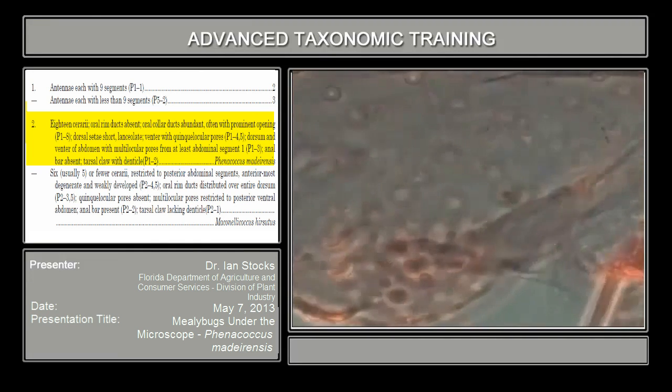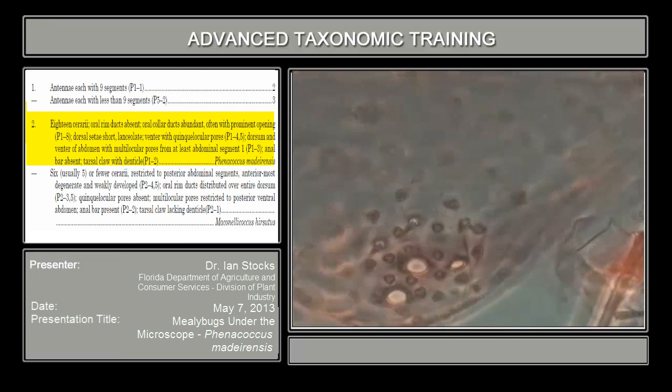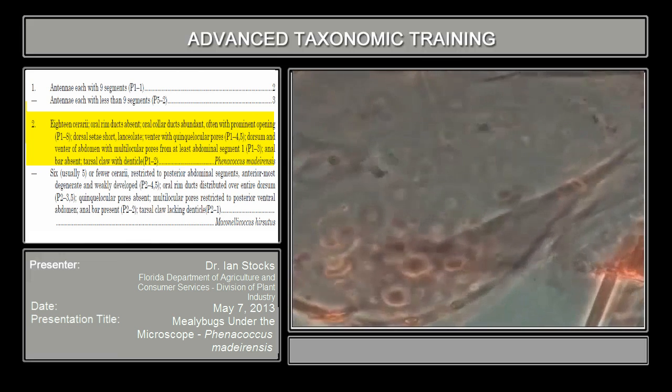In all but a few genera, the anal lobe will be reasonably distinct, even if it doesn't have a readily identifiable cerarius. There's not that many trilocular pores. The cerarii and cerarian setae are absent or feeble. It'll still be relatively lobe-like, though it may not be extensively lobed.